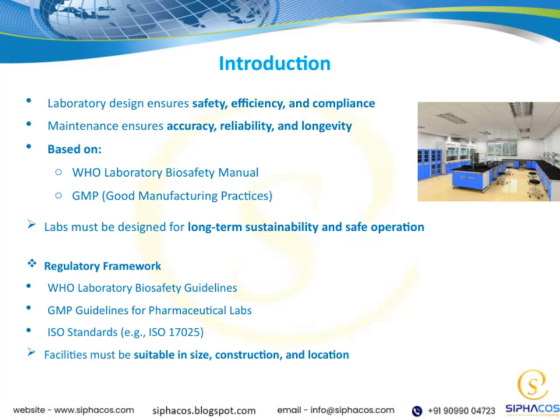Welcome to our discussion on laboratory design. As we look into this, it's important to understand that a well-designed lab is foundational for ensuring safety, efficiency, and compliance with regulations. When we talk about maintenance, we're emphasizing how regular upkeep helps maintain accuracy, reliability, and extends the lifespan of our facilities and equipment.